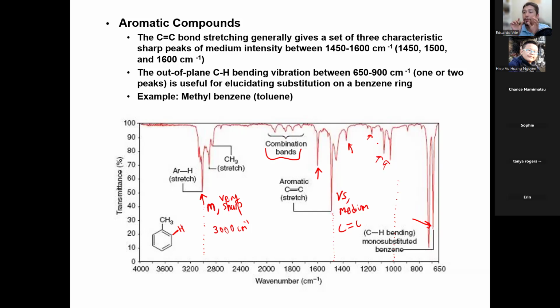Because we're only looking for very characteristic signals. There's a whole bunch of signals. I'm sure we could sit down and analyze this, but you need actual quantum mechanics, you need vibrational spectroscopy mathematics, you need vectors and a whole bunch of other nonsense. The organic chemist only wants to confirm if things are going in the right direction. If you're trying to synthesize a functional group and you don't see the signal, something went wrong, flat out. You don't need any more information than that, right? So we're only looking for very specific signals in very specific places.